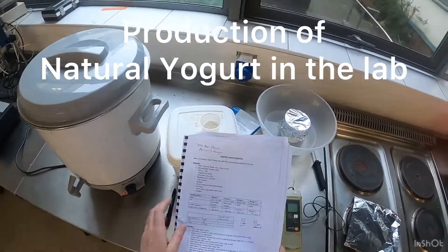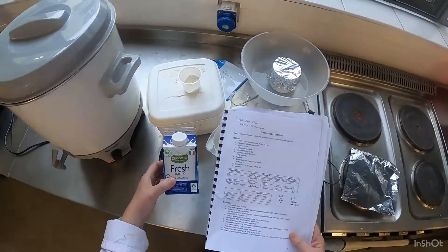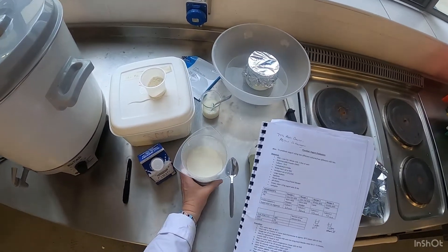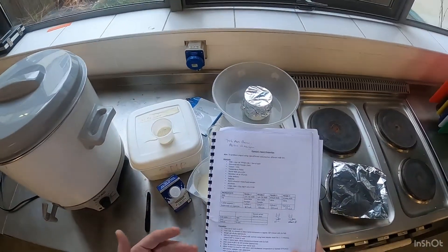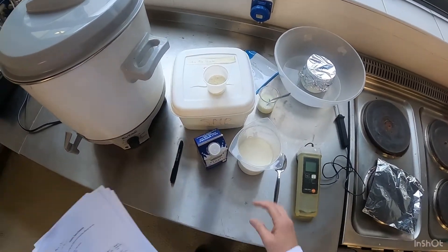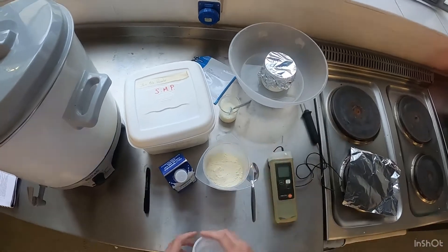We're going to prepare some natural yogurt. I've taken 1 liter of whole milk, added it into my container, and heated it up to about 50 degrees. I've weighed out some skim milk powder — the skim milk powder will give the yogurt a bit more body. Once I do that, I'm going to mix in the skim milk powder, which I add at about 2 percent.